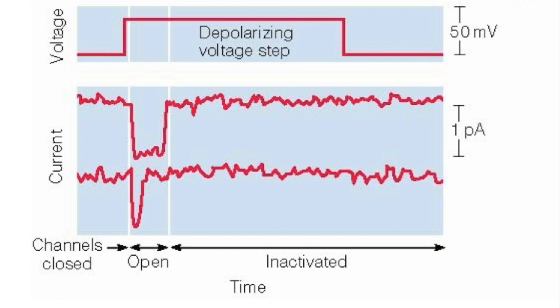And that, again, resulted in a Nobel Prize, of course, and really allowed us ultimately to confirm a lot of what Hodgkin-Huxley first formulated, but at a much finer scale. That's, of course, the beauty of this, that we're able to extract individual ion channels and study them in true isolation from any other ion channels that might be nearby. And so, again, these are the two major types of techniques that make up electrophysiology.